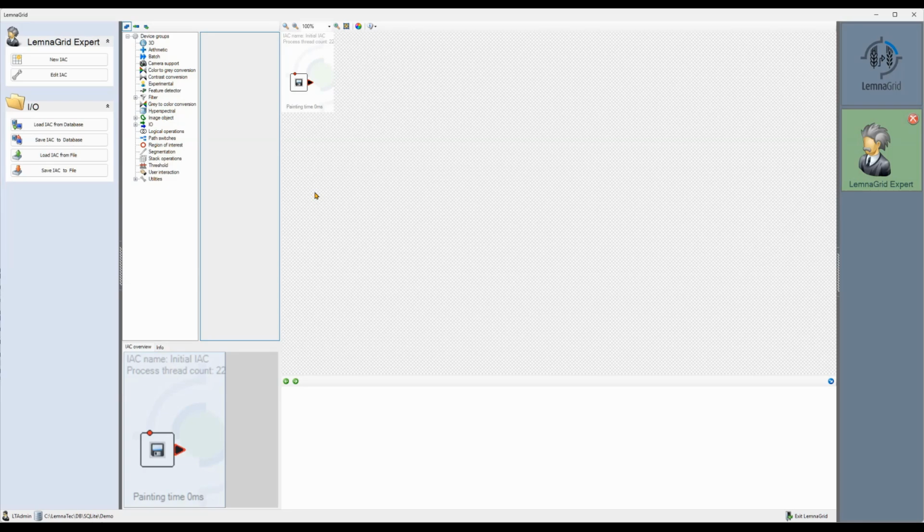It must include a few normal examples, but it doesn't hurt to put focus on the extremes. That said, we will start the development with just one or very few example images, say up to 3, and use the others later to fine-tune the analysis. You can use LemnaExperiment for the selection. Save the snapshots containing images you identified as example images somewhere on your local disk. This is what I have done in preparation for this video.